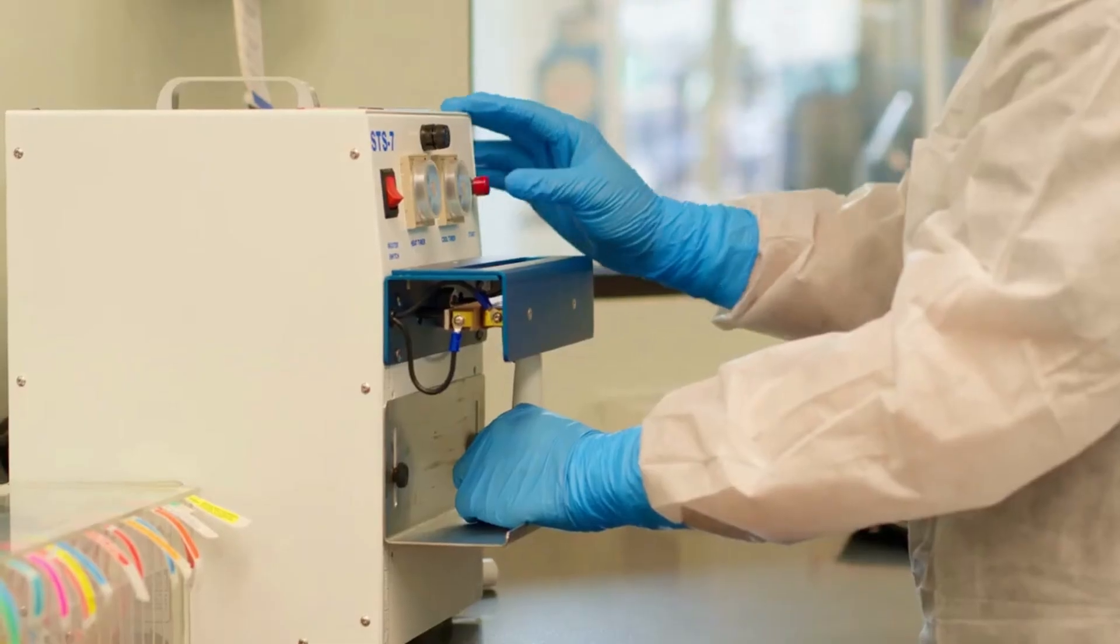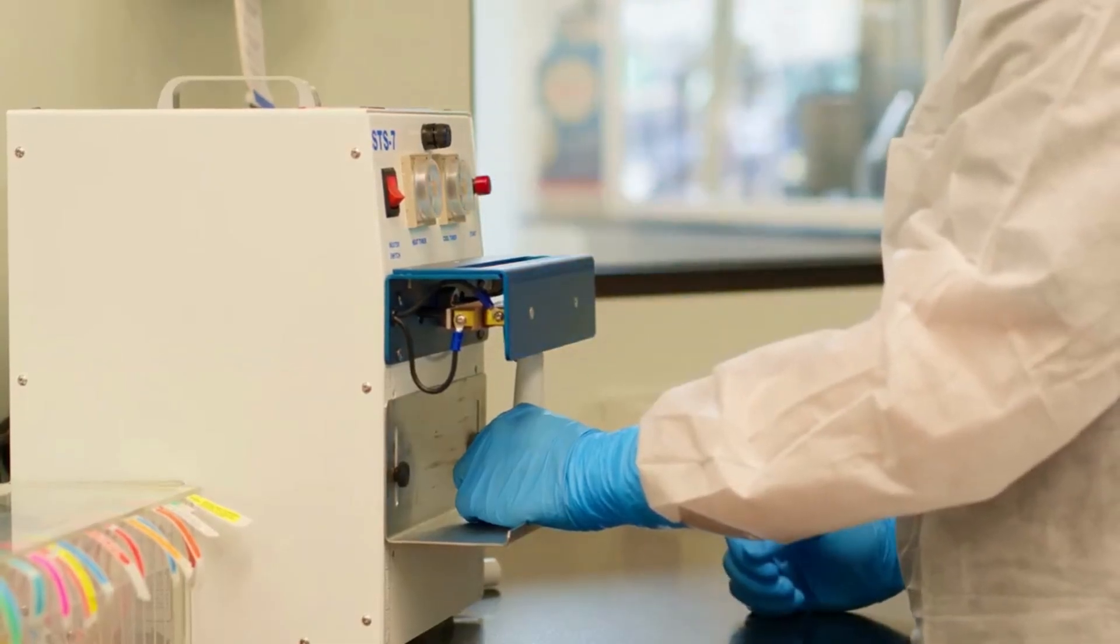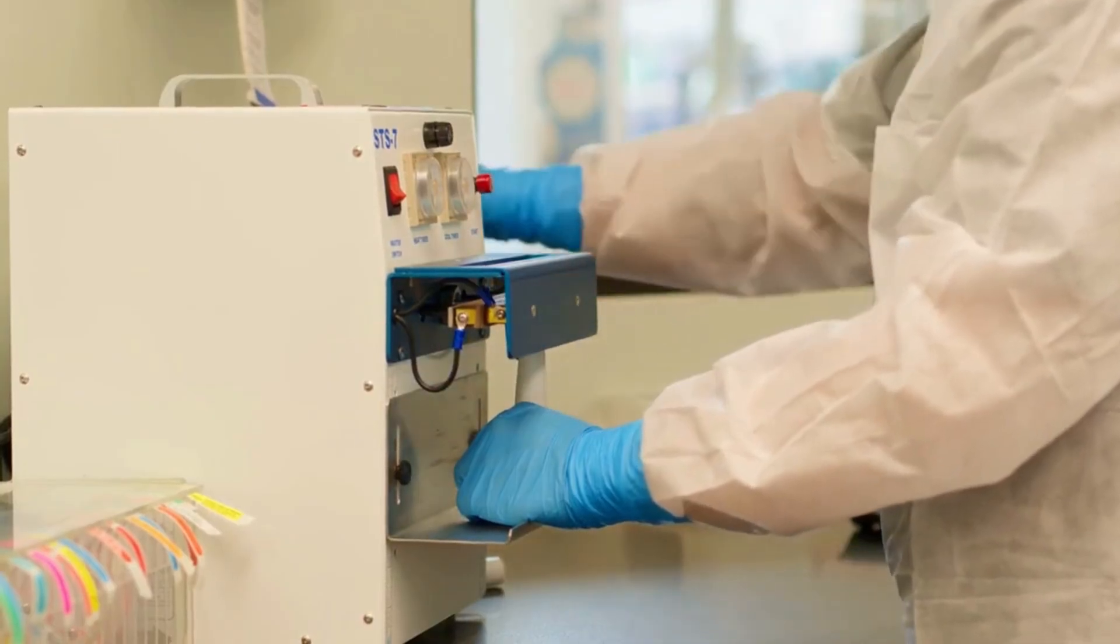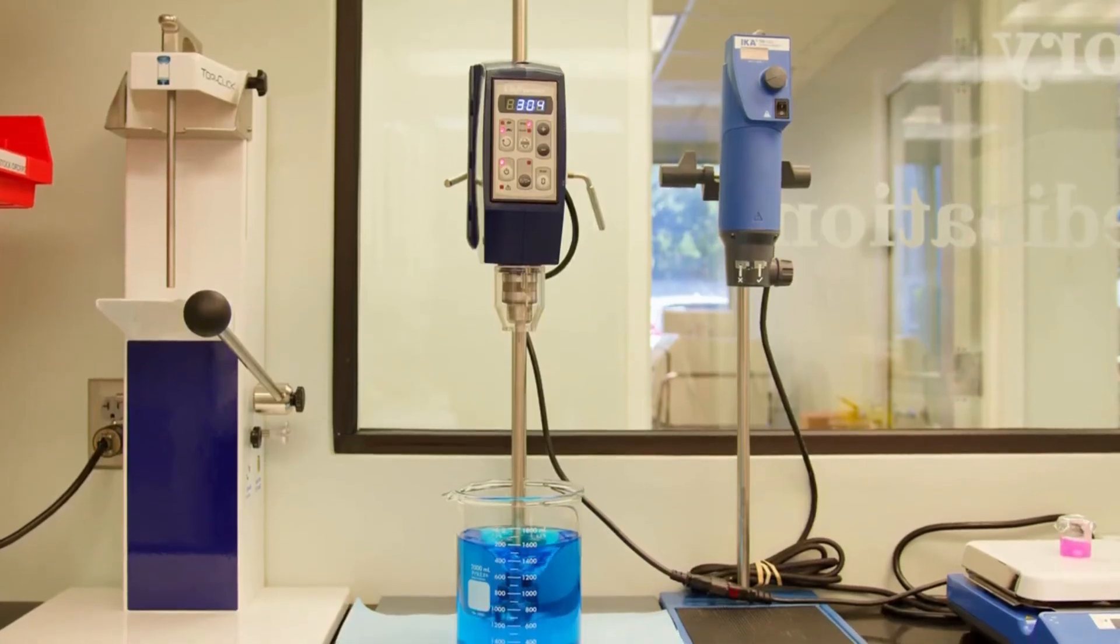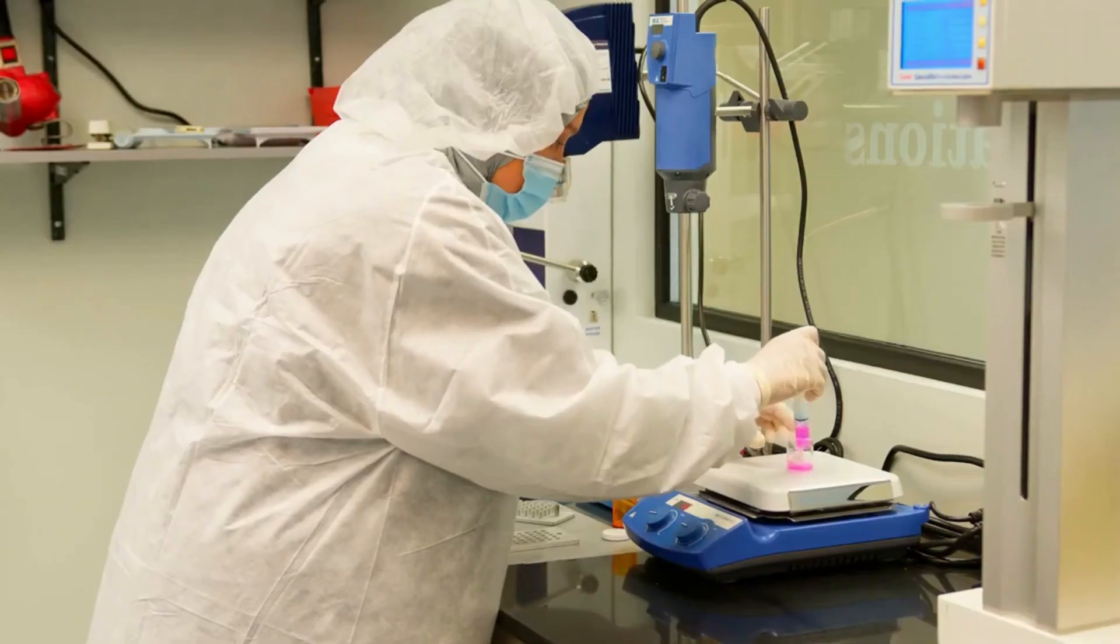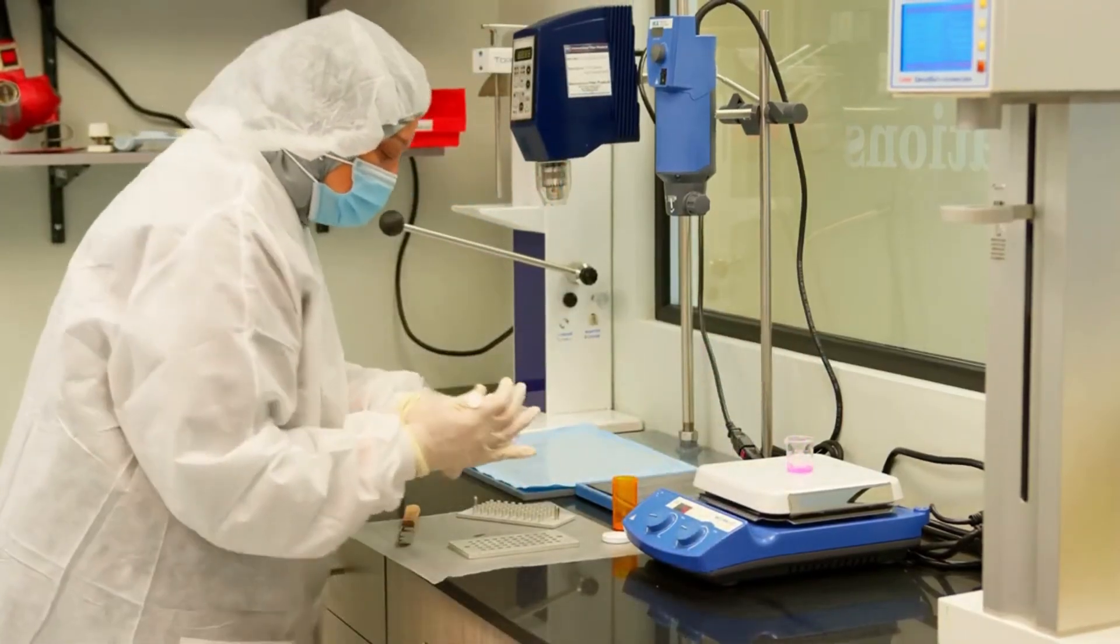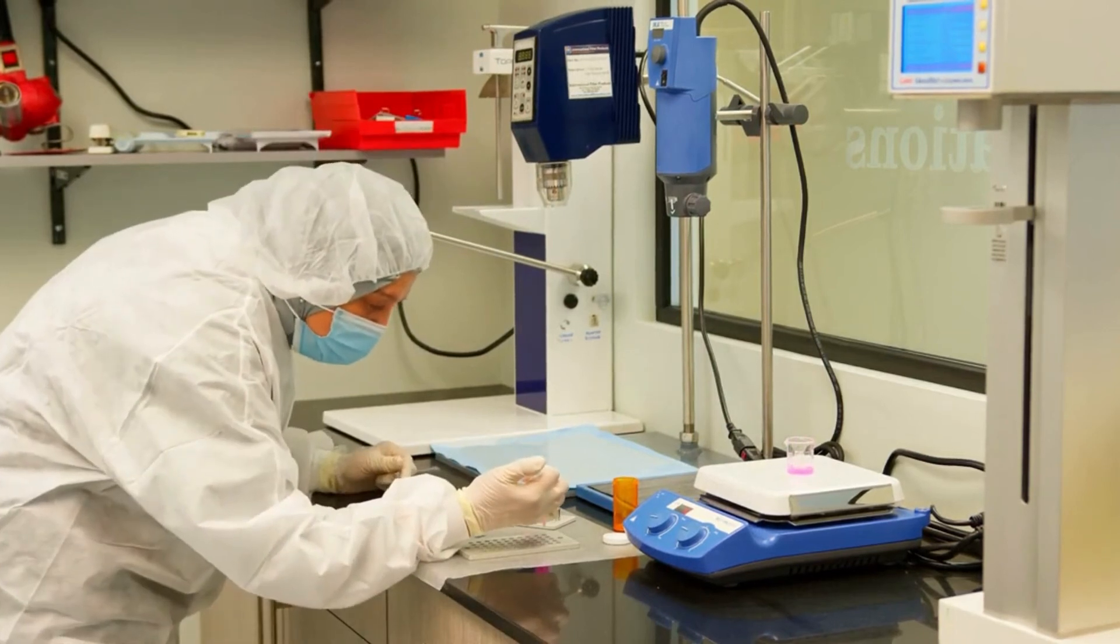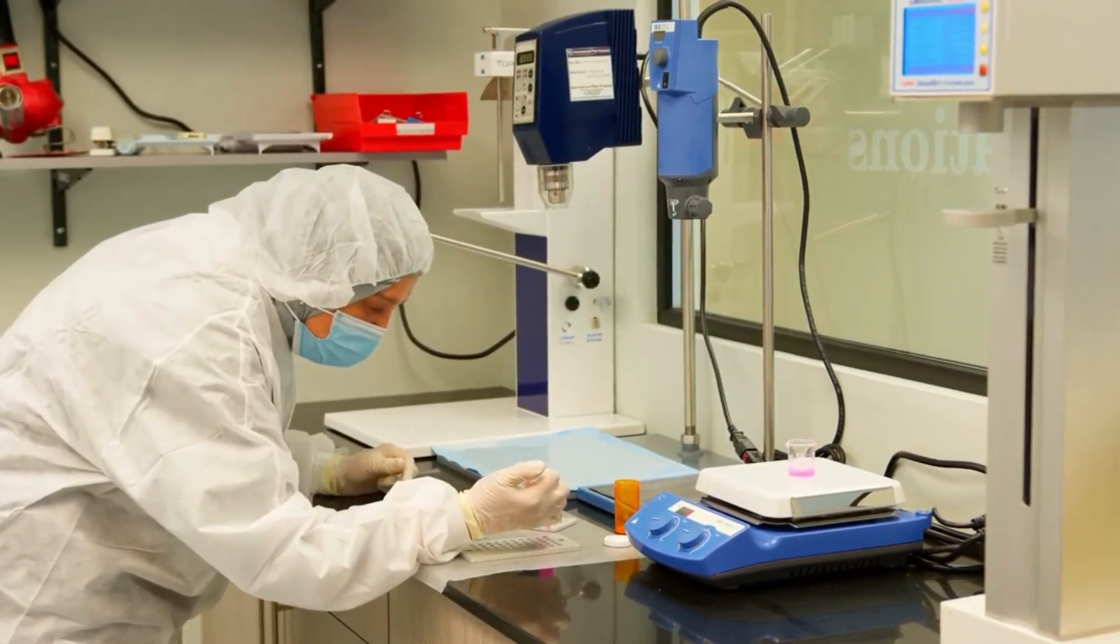This is also required in our non-sterile labs. We also exceed standards by routinely testing potency, sterility, and endotoxin levels of various compounded medications at an outside analytical lab. We do this to validate our personnel and to ensure that your patient's medications are compounded to the absolute highest standards. Doctors trust Town & Country Compounding for high-quality compounded medication that makes patients better.